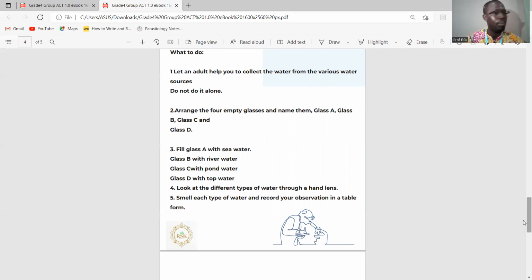All right, so I'm going to look at my first water sample. That is the river water. If I bring it closer, I hope you can see. Now this is river water, and even without doing anything to it, you can see the particles at the base. Apart from the color, you realize that there are even particles in it.